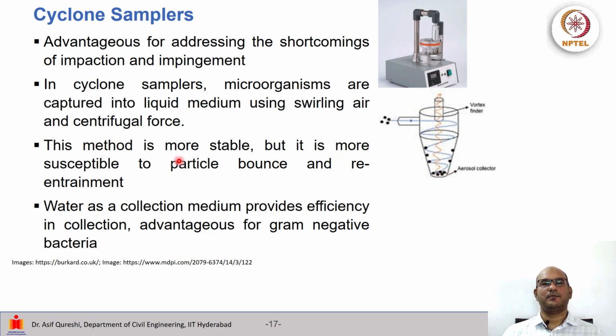So the method is stable, but it may be susceptible to particle bounce and re-entrainment. Some of these particles can move up again. Sometimes water can be used as a collection medium, and this method is good for collecting gram-negative bacteria.